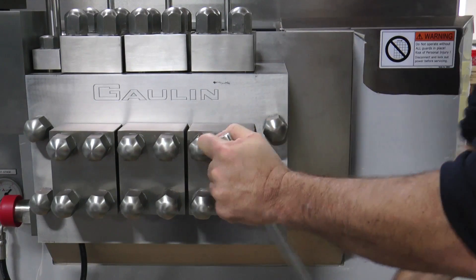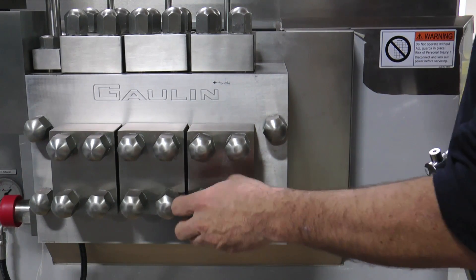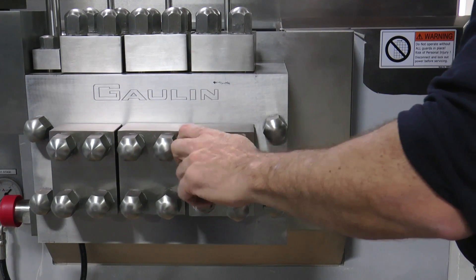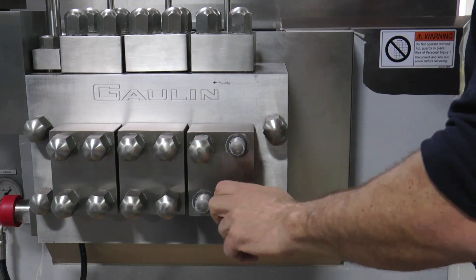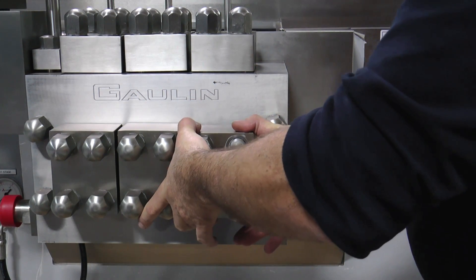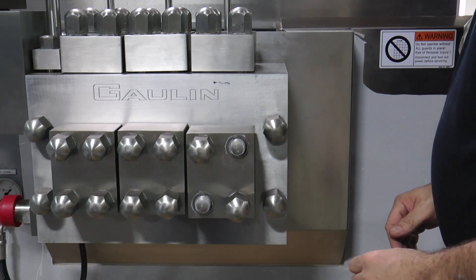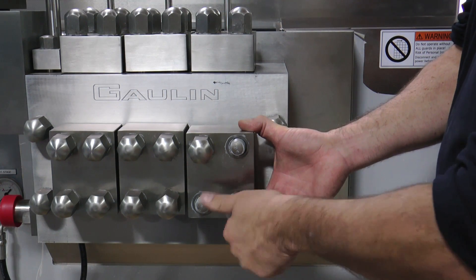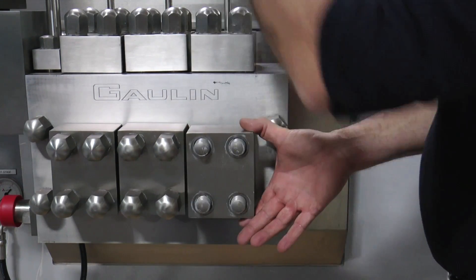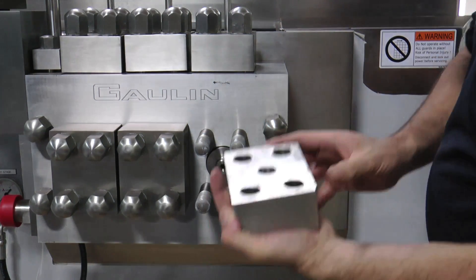Loosen the four nuts on one of the front caps. Then remove two of the nuts in a diagonal pattern, leaving two intact in case the cap comes off under pressure. Then back off the two remaining nuts, being careful not to fully remove them. Pull the front cap forward. If the cap does not come off easily, give it a firm wrap with a rubber mallet. Once loosened and pressure released, the other two nuts can be removed and the front cap completely removed and placed on a flat, clean surface.